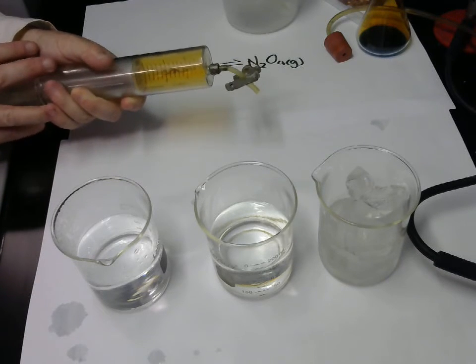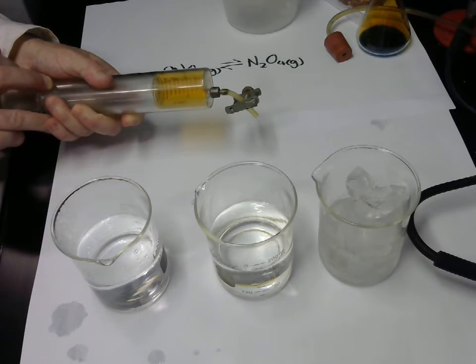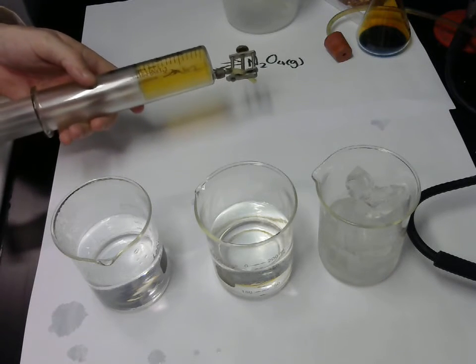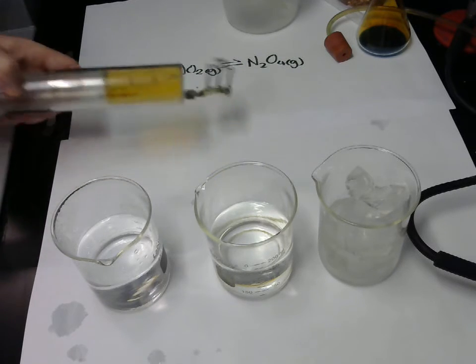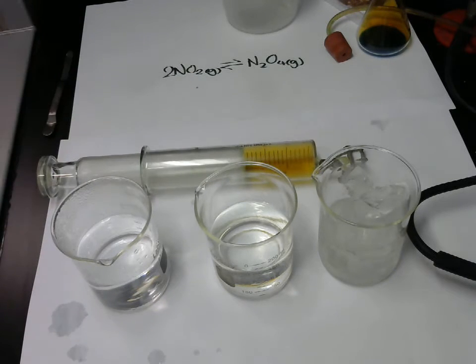So I push it in and the concentration increases, so it gets a lot darker, and then as I hold it, can you see what happened there? What happened after it got darker? It started to go lighter again, didn't it? For you guys that are watching there, I'll just do it out here. So push in, it's darker, you see it starts to fade immediately, and I held it in place. So that means increasing pressure has favoured which reaction?